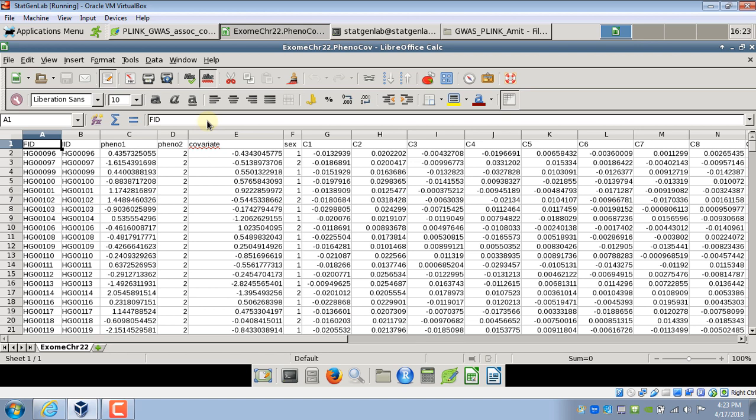This file has headers. The first two columns have to be family ID and individual ID with the headers FID and IID. So third column onwards you can have any kind of phenotype or covariate. Since I combined these phenotype and covariates in one file I have both of them but you can have two separate files, one for phenotype and other for covariate.